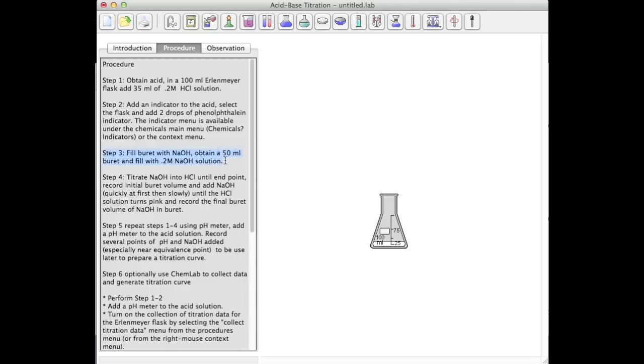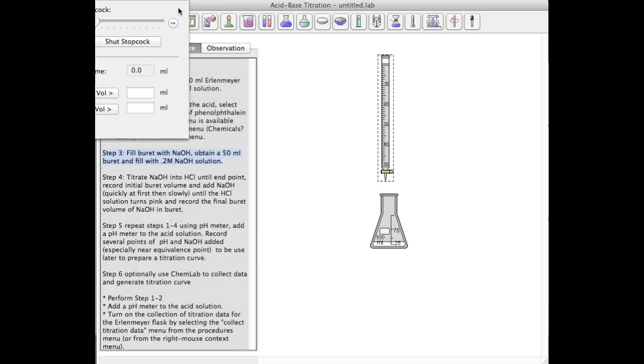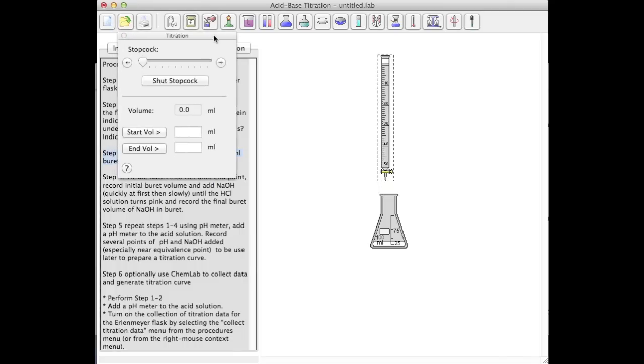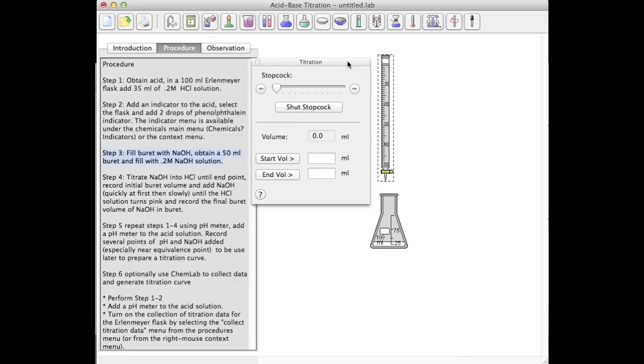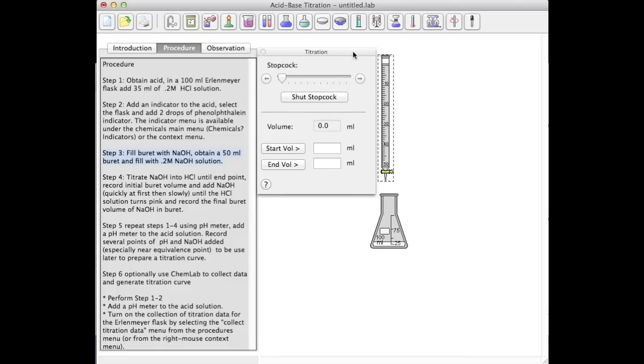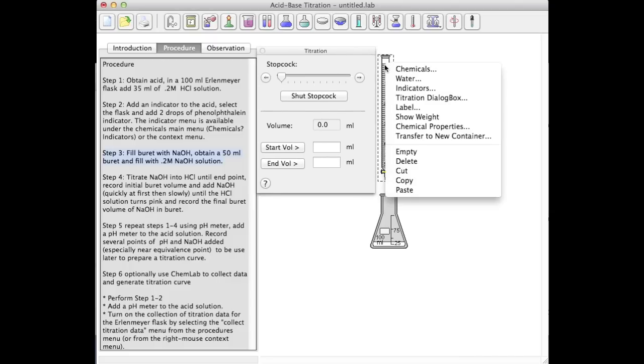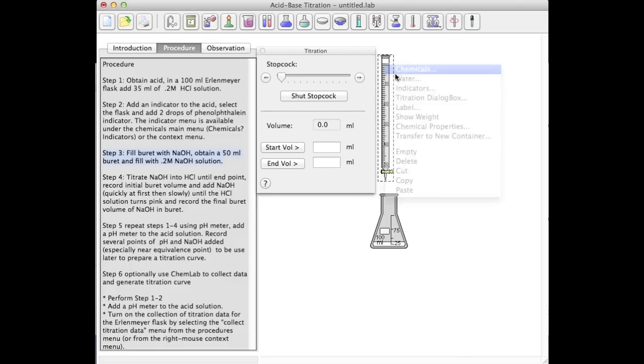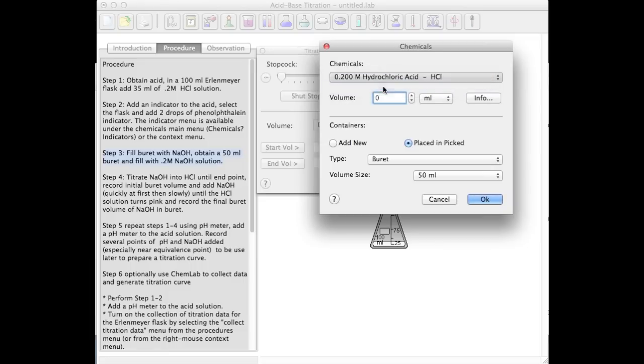Finally, I'm going to set up my burette. Again, I'm going to use the context menu for the chemical dialog box and add my sodium hydroxide to my burette.